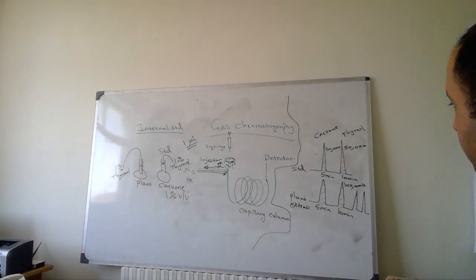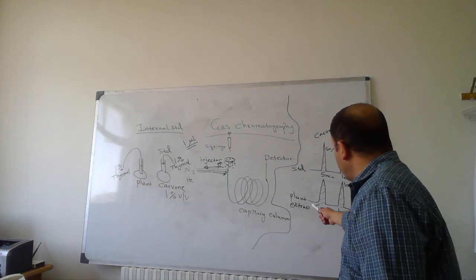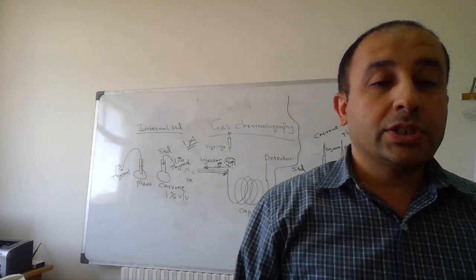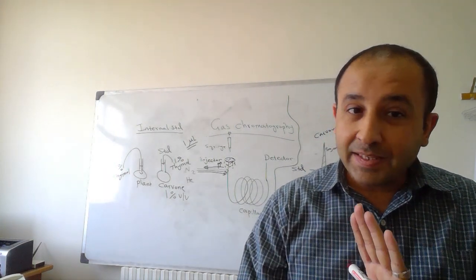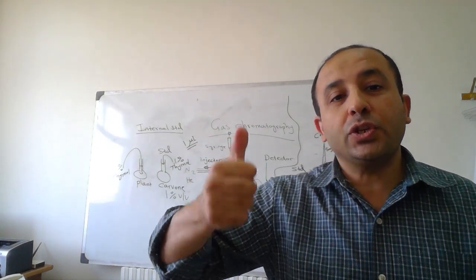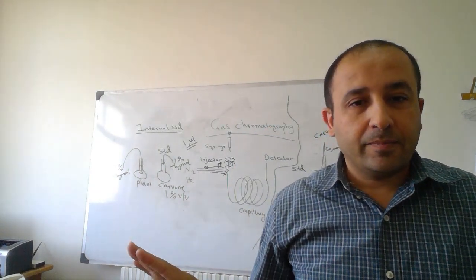So the concentration of thymol in the plant extract is double that in the standard container. Thymol, I put the same quantity. So the doubling of the quantity is due to what? Doubling of volume, because the concentration should be similar.